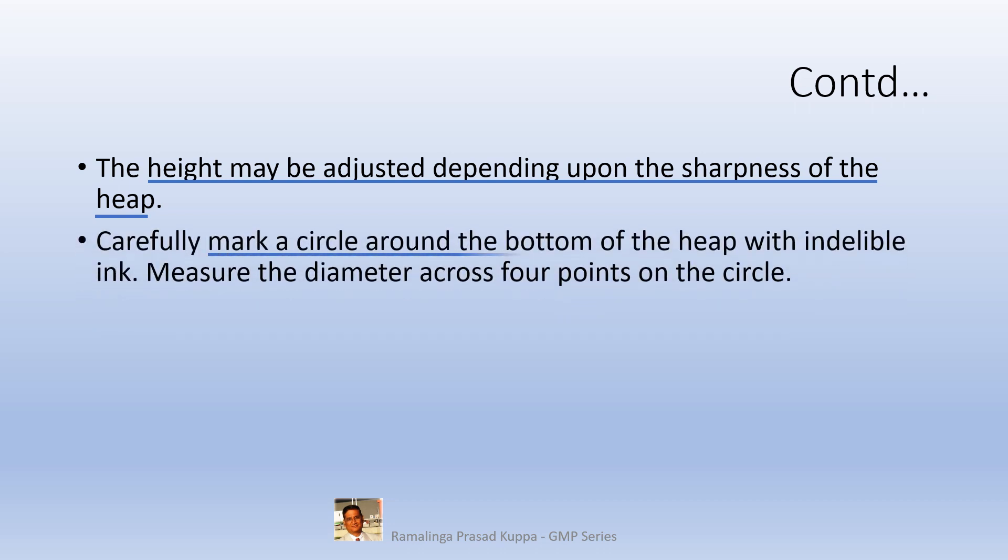Clearly mark a circle around the heap with indelible ink. Measure the diameter across four points on the circle. So mark the circle with pencil or pen carefully around the heap on the paper. Remove the powder from the paper and transfer it into the container. Measure the diameter across the circle at 4 points. Take average of the diameter in centimeters.